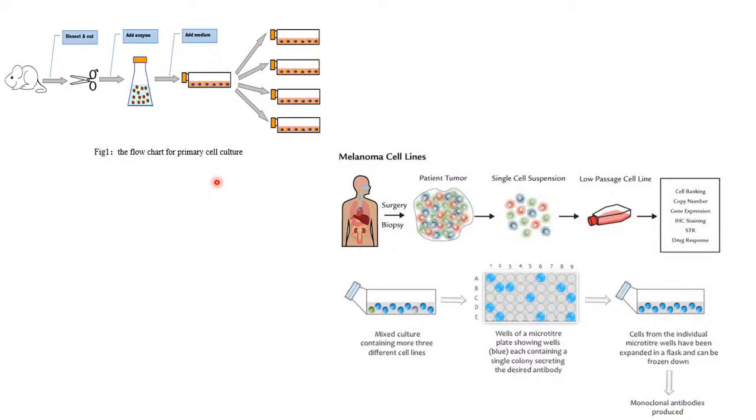So cells themselves are telling us they have these properties, and if you want to culture them, then do this. That's why whenever I do cell culture in my lab and try to establish a cell culture based experiment, I ask the cells themselves. Asking them means I go to the literature: how they divide, how they live in their natural habitat, and can I copy that natural habitat in my cell culture flask?